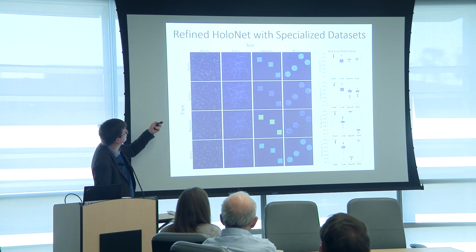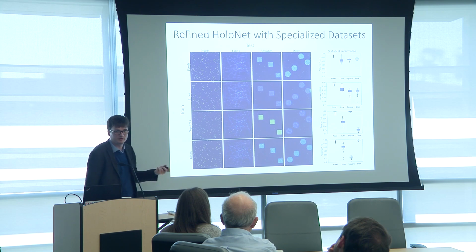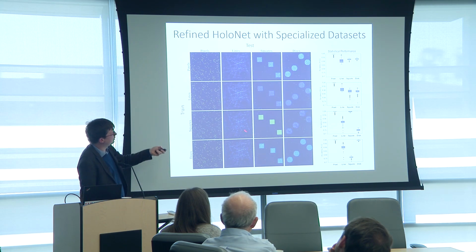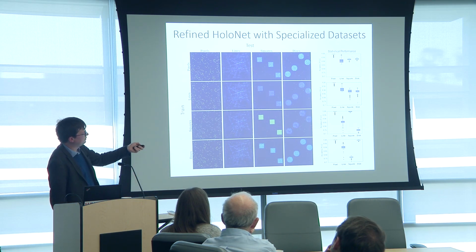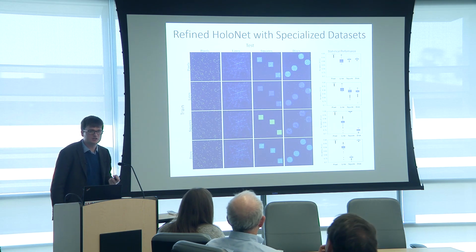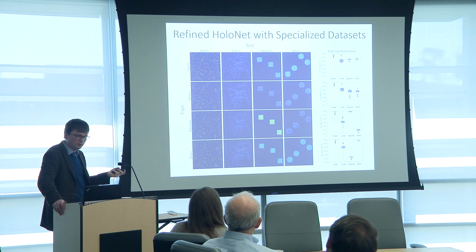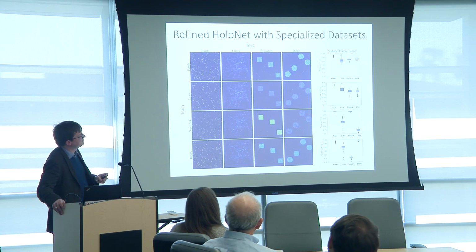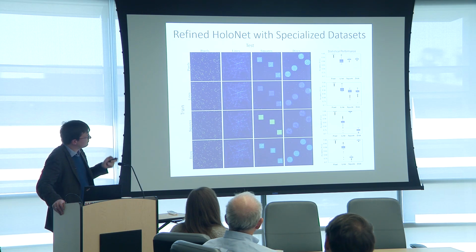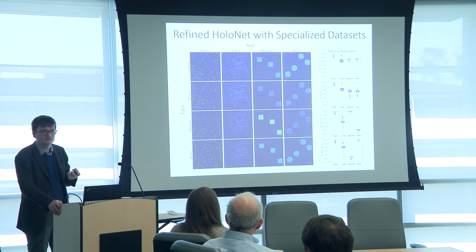And what you can see, the diagonal shows you, if you train a model on pixels and try to make pixels, it'll perform well. If you train a model on squares and try to make squares, it'll perform well. Same for disks. And if you look at the statistical data across multiple iterations through that type of data sets, you can see here that this approach works, and this is very preliminary data, I would not publish that data set as is. The idea is that the training can be refined to specific subsets of holograms.